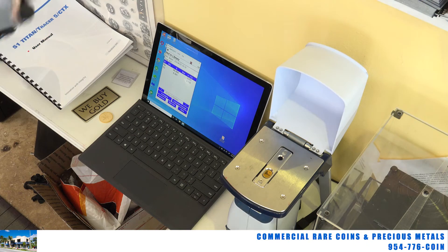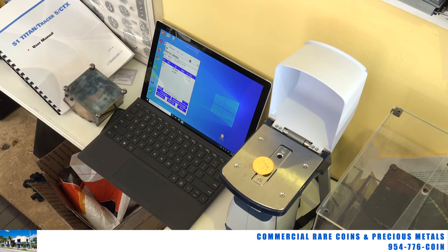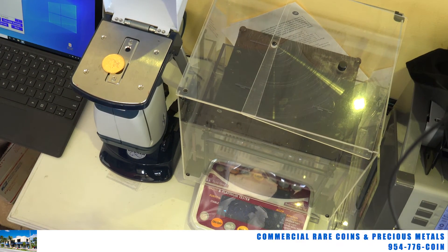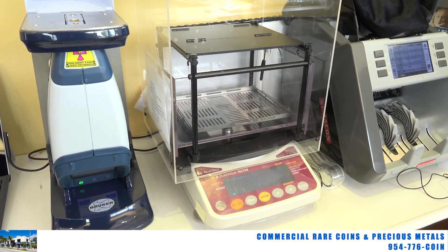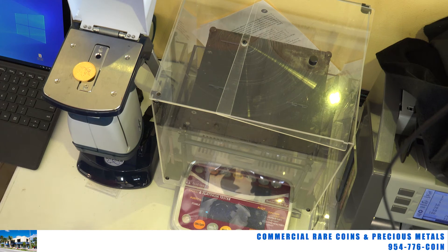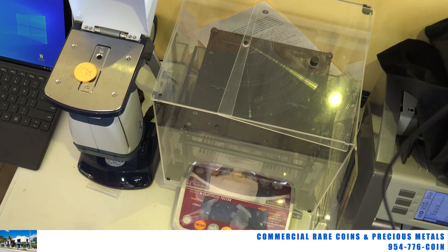You're probably asking yourself, how do we tell what's inside the metal? How do I tell if a gold coin is gold plated and loaded with copper inside? Well, this is not the machine you use for that, even though a lot of people mistakenly assume we do. The machine you use is a specific gravity testing machine, which we have to the right of this machine. It's a scale — we fill it up with water, weigh the item before and after submerging it. You'll remember this from basic science. This machine tells us what is on the inside of an item. I'll leave that for another day.